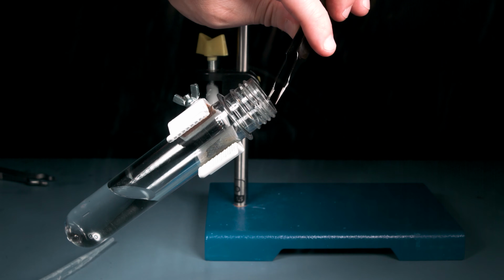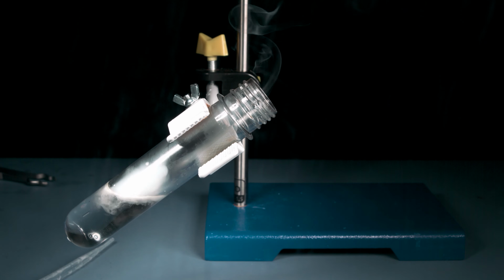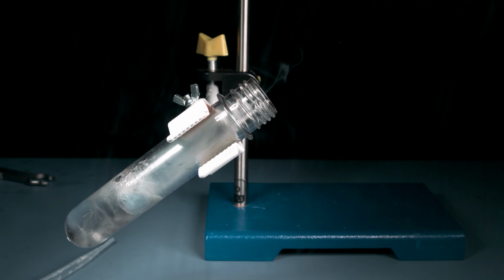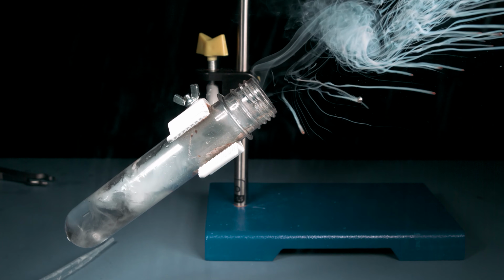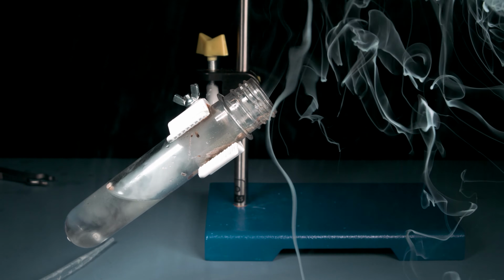Now here is a test tube. I'm dropping some potassium into the water. You'll see that it begins to react immediately and starts to produce hydrogen gas. When I speed up time a little bit, you'll see in real time how fast it's producing a lot of hydrogen gas. If that gas is burning down there, which is possible, then it's with a transparent flame, because I couldn't pick it up on the camera. Eventually it reaches a critical point and then it begins to explode and shoot the molten potassium out of the end of the test tube. If you look closely, you can see that those molten bits are glowing yellowish, kind of amber colored, and it's over in a second.